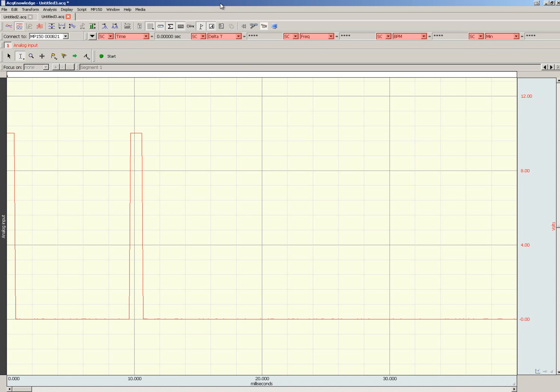This video is a quick demonstration for how to set up AcqKnowledge to send two separate trigger outputs at the beginning of data acquisition. In this case, we have connected a cable from the analog output of the UIM100C and feeding it back directly into channel 1 of the UIM100C. We've made sure there are no other channel conflicts on channel 1 of the UIM100C.